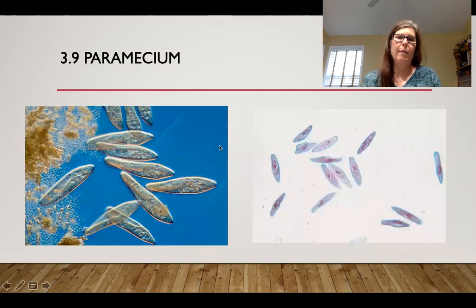Then we have the paramecium. Usually when we get these out of the live culture, and a lot of times we see them when we look at the Elodea, the aquarium plants too, you can see there's nice organelles in there. This would be what the live one looked like. Now we would have had a nice one. This one's stained. They are already prepared and fixed, so they're dead, right? So we squished them in there, glued them to the slides already pre-made for you, and you can clearly see the nucleus inside this cell. So that can definitely stand out as being eukaryotic versus prokaryotic if we ask you that question.